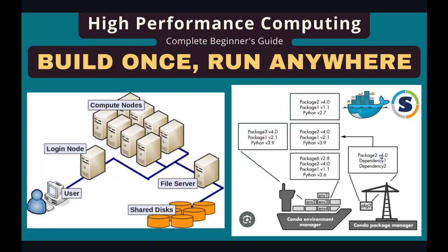In our previous tutorials, we have created multiple Conda environments for different analyses. The reason why we need independent Conda environments is that different analyses require different tools, which rely on different dependencies, or the same dependencies with different versions. For this reason, installing all the tools and dependencies in a single environment almost guarantees conflicts. Creating isolated environments can solve this problem.